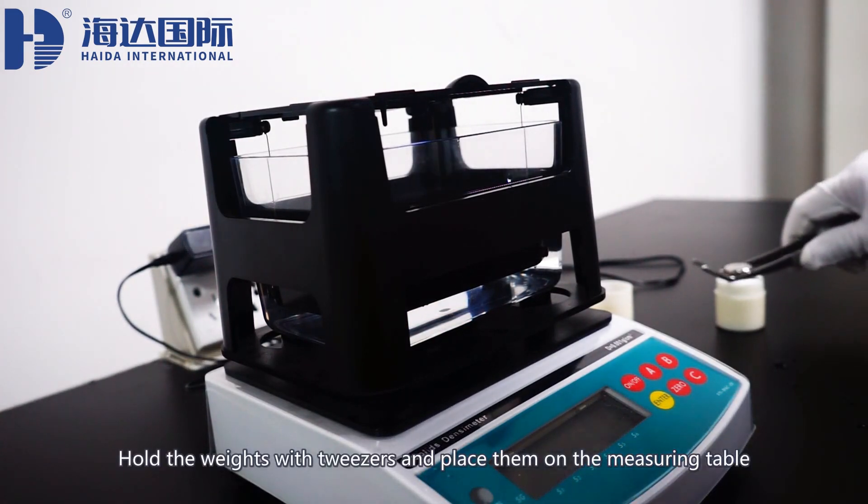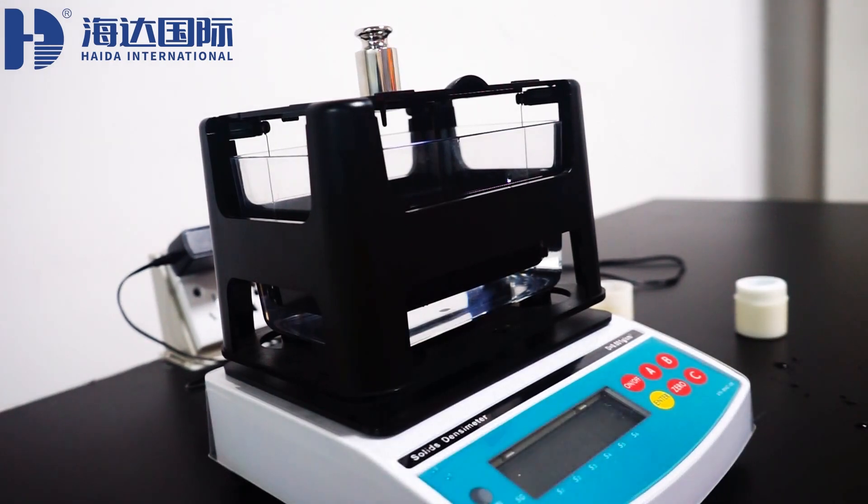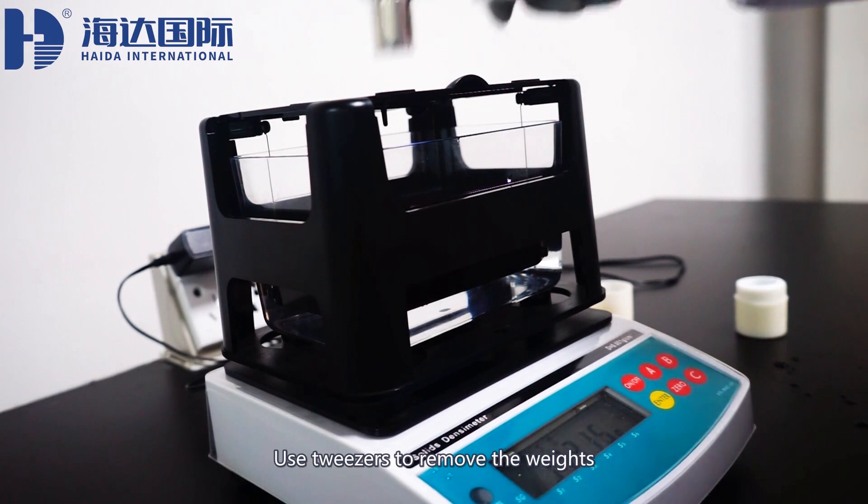Hold the weights with tweezers and place them on the measuring table. Wait for the instrument to show the reading, and use tweezers to remove the weights.